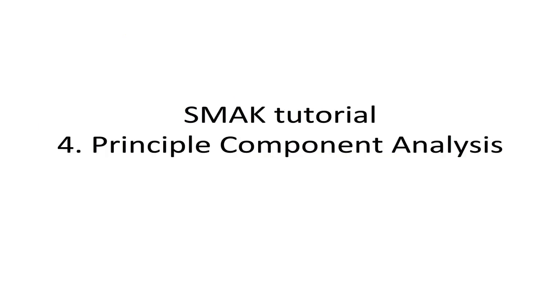Please see the next tutorial for looking at principal component analysis.